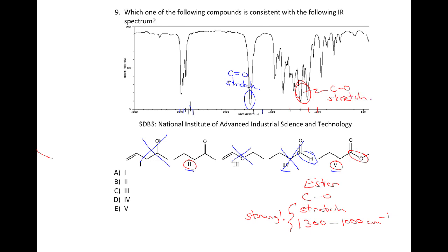So therefore, I know that this must be compound number 5. It must be an ester, and it's not compound number 2.